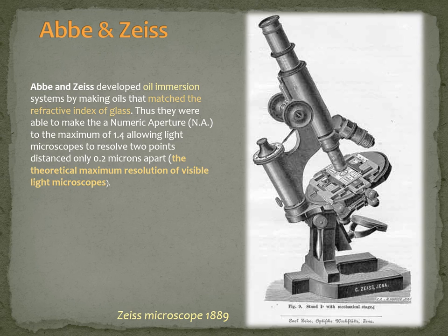And this is something that fascinates me, how they could do it, how they could predict this such a long time ago, at the beginnings of light microscopes. In practice nowadays we can actually go a bit further in resolution, but some tricks have to be used, some mathematical tricks or other systems that are not in the scope of this talk. But by using a light microscope, this resolution cannot be broken by direct observation.